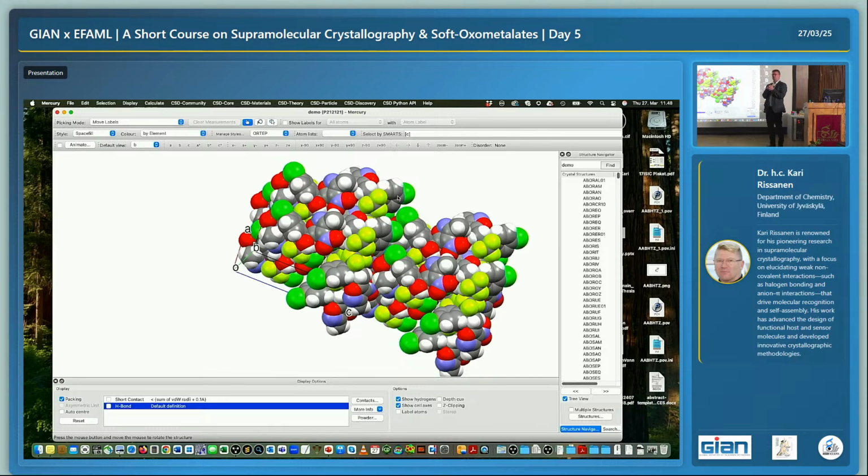Now we have been talking about the COFs and MOFs and all these porous materials. It means that in the structure there will be a pore or a cavity or whatever. But in this structure there's not. All the molecules are packed this way. And this is what we can do with this program. We don't have time to go through a rehearsal or practice this, but just download, get the program. You have the file, then you can play around with this, or with your own. Maybe now or in the future, if you're doing this kind of work, you can use it for that purpose.